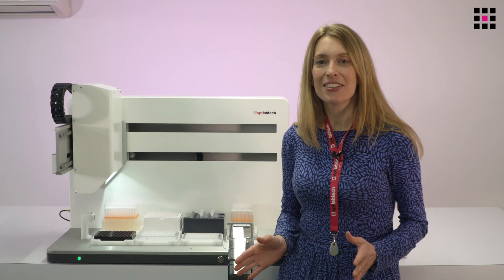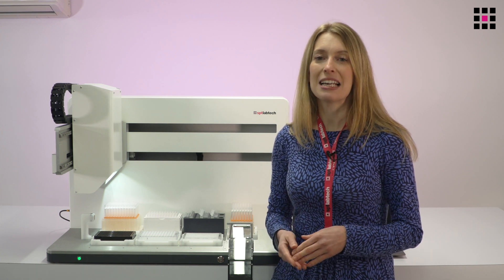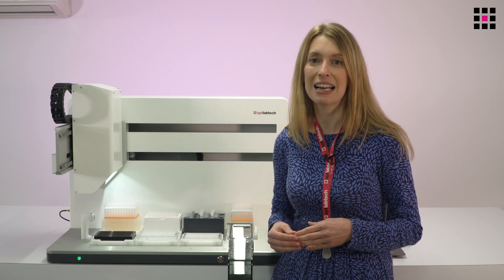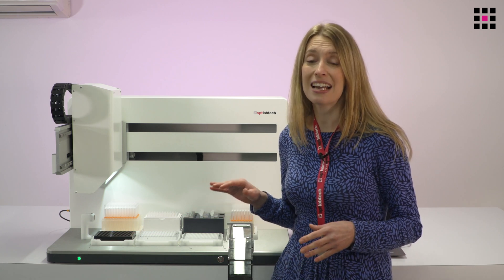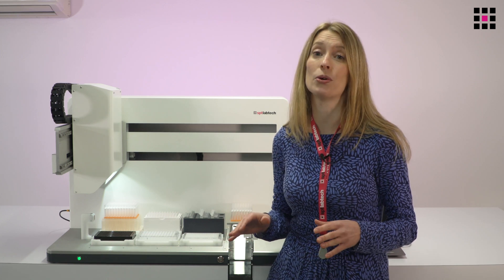I'm excited to introduce you today to Apricot DC1, our affordable and versatile automated pipetting workstation. Apricot DC1 is part of a new generation of automated pipettes that delivers the power and flexibility of a large liquid handling station in a small and affordable benchtop unit, and as such it is an ideal tool for users wanting to take their first step towards automation.